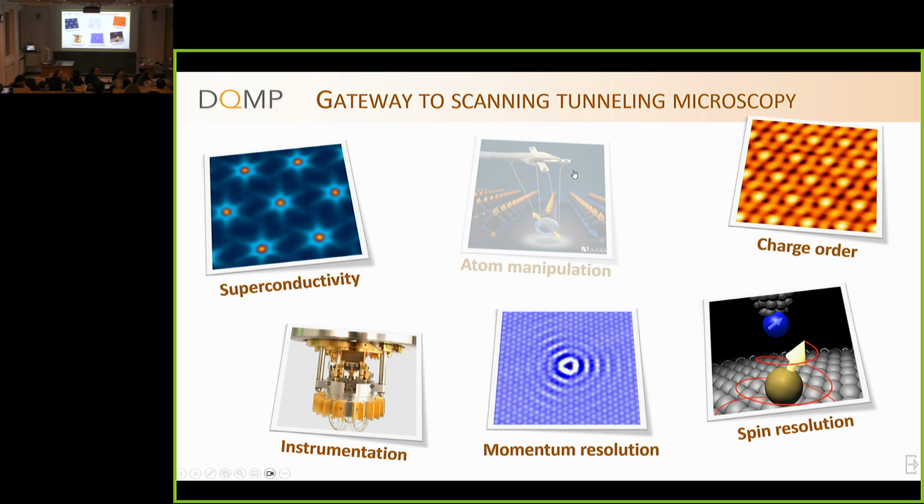Is it possible to automate these systems? Sure. But still, we are talking about atoms, and your tip will drift. Any temperature change will change the place you are, and so there are protocols where you can stay at the same place. My first postdoc is in a company in the US, Zybex, that does atomic scale lithography.